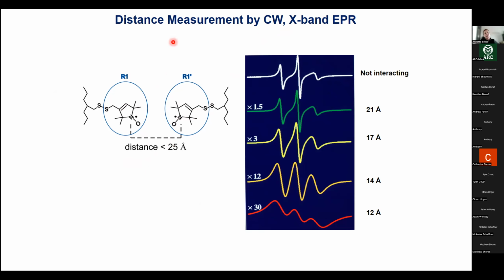And again, the magic is in doing line shape analysis. Let's say our two spin labels are attached to flexible loops far away from each other so that they don't interact. So the spectrum of that doubly labeled sample would look like a simple addition of the two single spectra. And it would look like a nice mobile spectrum like we've seen when we looked at tertiary structure.